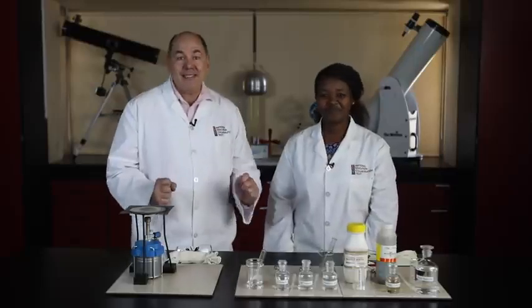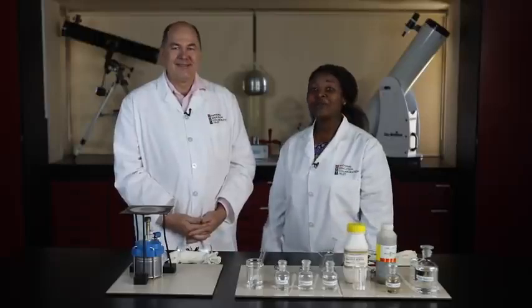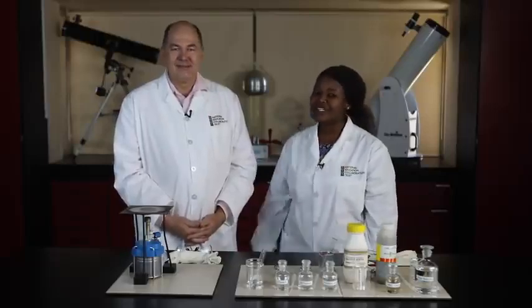Today we're putting organic chemistry into practice. We are making esters. Although you won't be able to smell these fragrant compounds, you will be able to see the process of making them in small quantities.